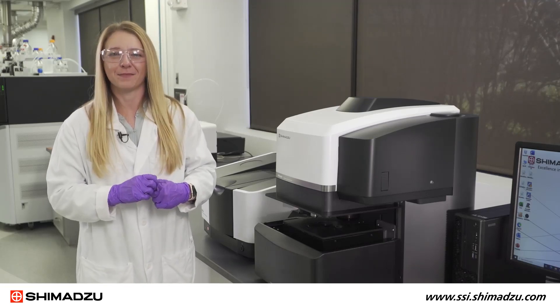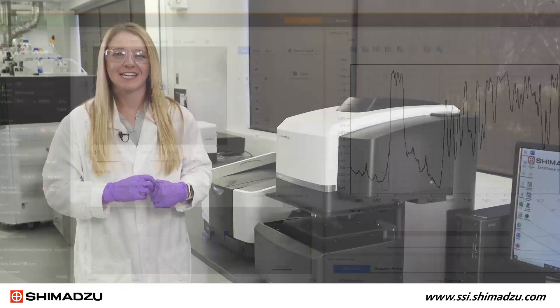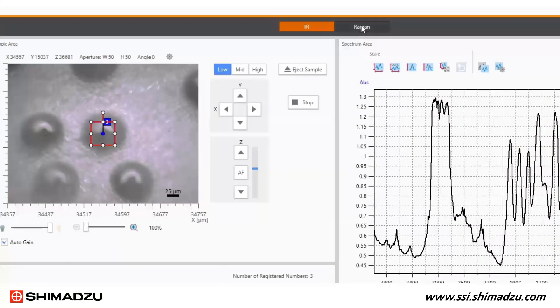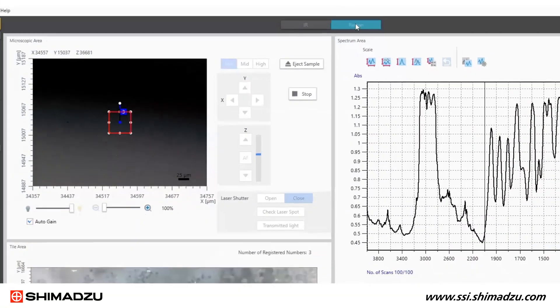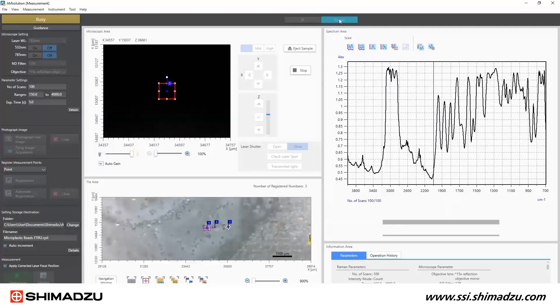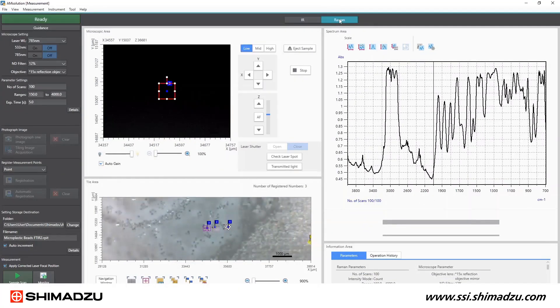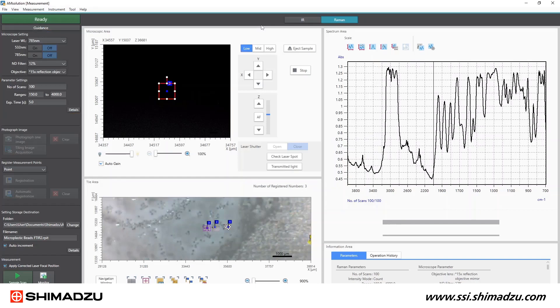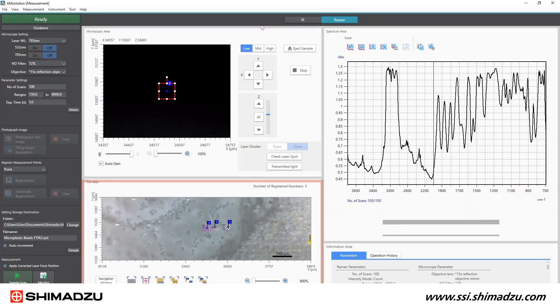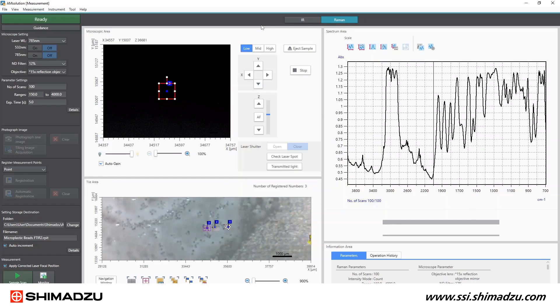Now that we have the FTIR microscope settings and sampling position set, we can move on to the Raman mode. Simply click on the blue tab at the top of the window to switch to those Raman settings. Similar to the FTIR measurement settings, the AM solution software intuitively places the parameter settings in an easy to follow order. Notice how our sampling locations transferred over to the Raman microscope. We don't have to hunt for them again. I can simply double click on each point to jump to each microplastic bead of interest.